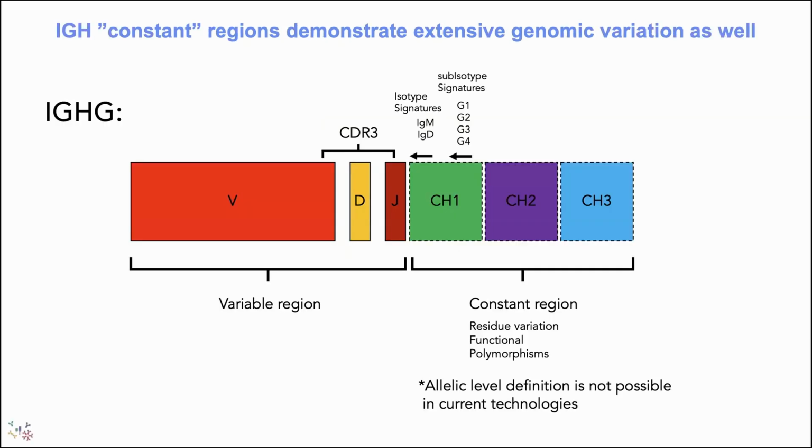So we're going to step back again and think about the structure of these molecules, because that's really important to understand why HiFi has been so powerful in us exploring them. This is a schematic of an antibody transcript. The VDJ cassette is glued together with those non-templated nucleotides. And the intersection between V, D, and J creates the CDR3 or hypervariable region that interacts with antigen.